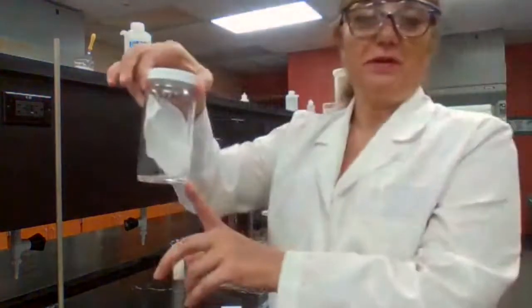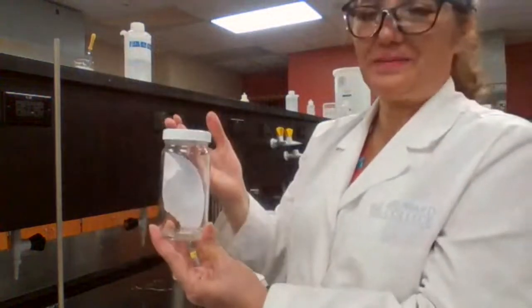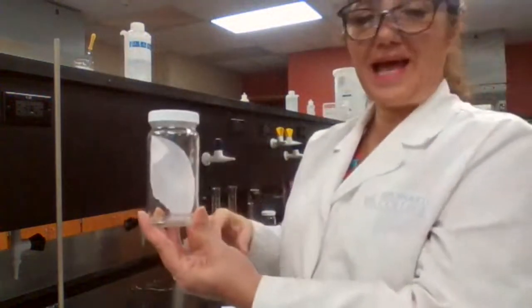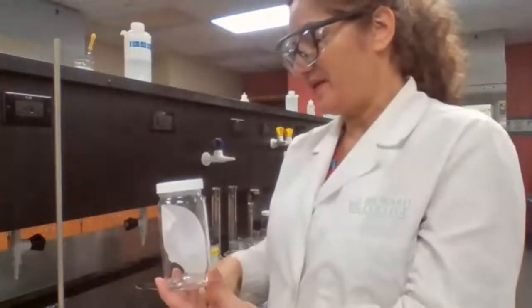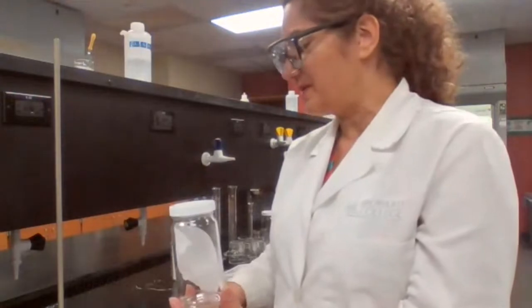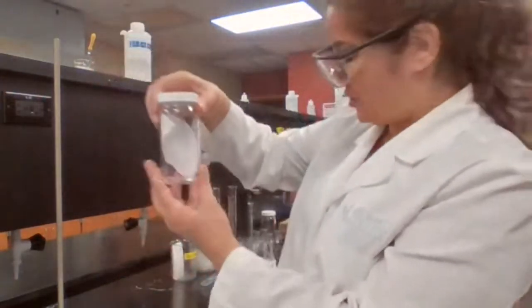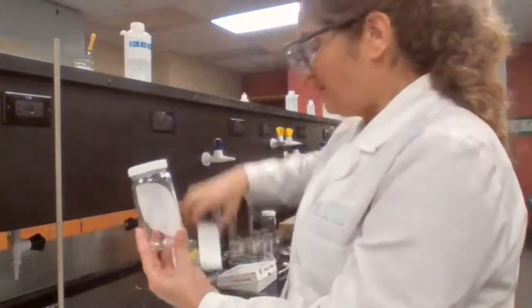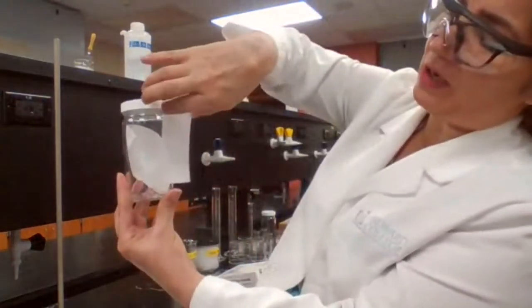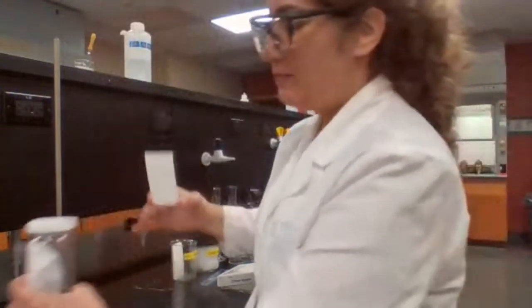I have the 5 milliliters. This 5 milliliters is not a magic number. It's just an approximate number that, based on the equipment I had in the lab, I chose when I was writing the procedure for this experiment in the lab manual, because with 5 milliliters I make sure that the level of the liquid is not higher than the level of the sample on my plate.